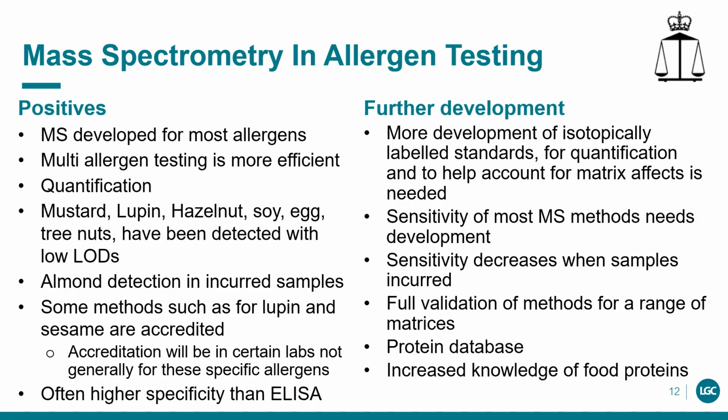However, current MS methods still require additional refinement to ensure they are sensitive enough to detect allergens at the recognized action levels. In addition, full validation of the methods across a range of different matrices remains to be addressed.